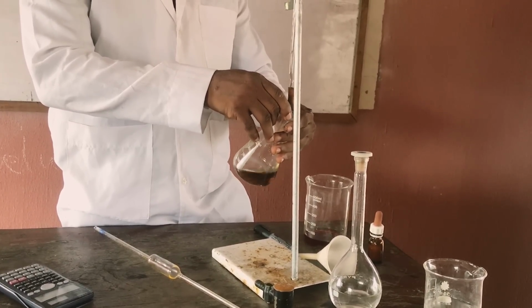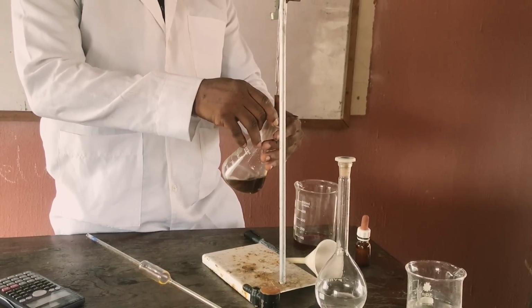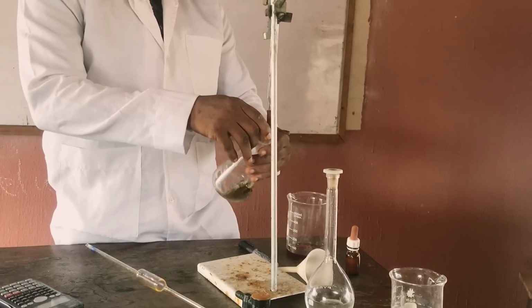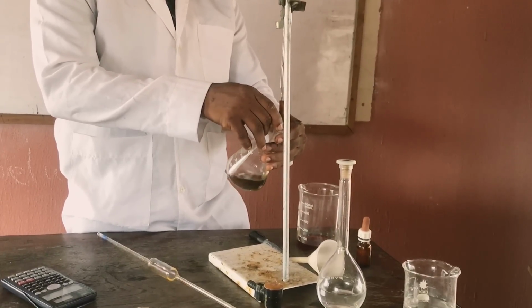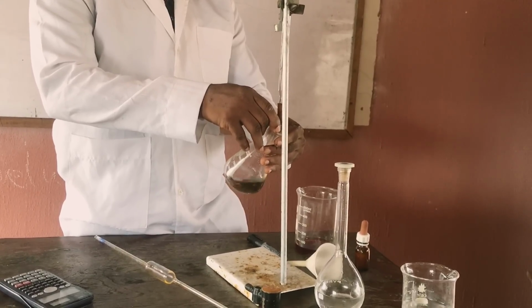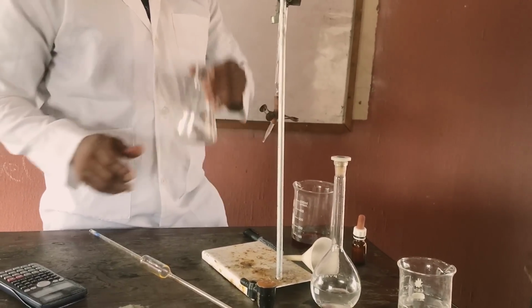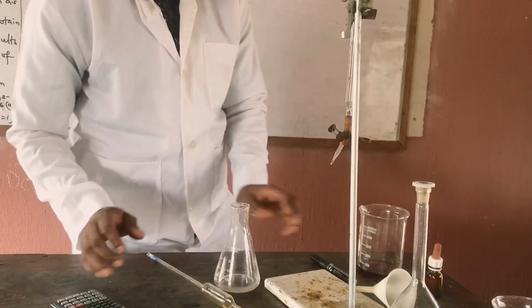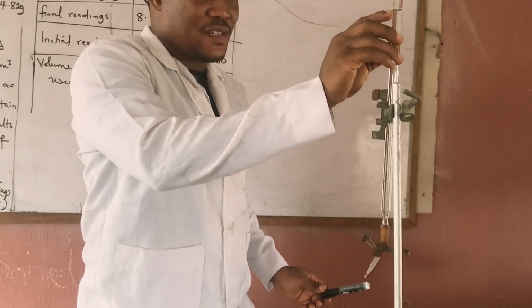Gently, please, gently, so that we can get an accurate endpoint. See, I'm just adding it, you can see. You can see that now. So let's go, 26.30. You can see. Bring it very close so that you can see.